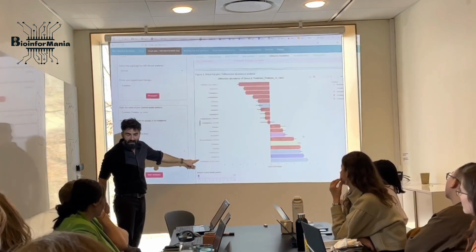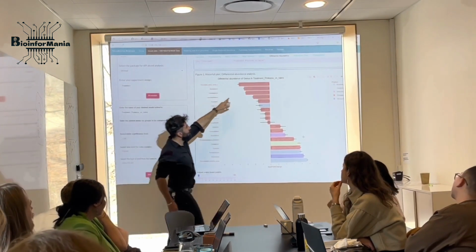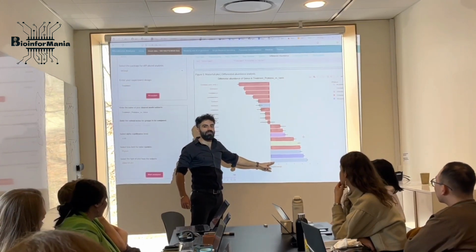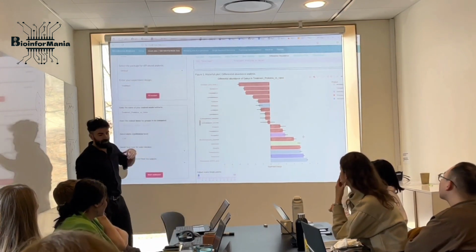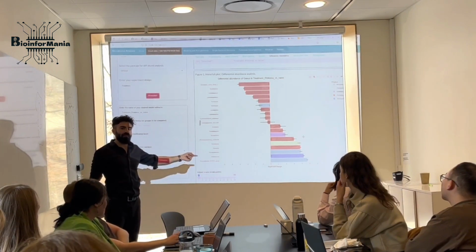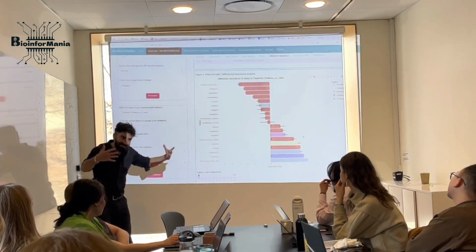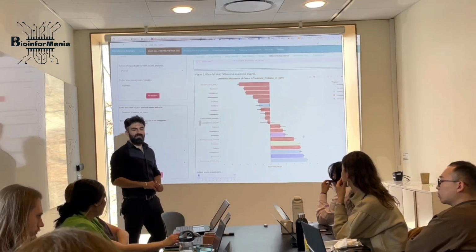And was it this guy? Yes. There we go. And it's protozoa versus naive. Okay? And again, I'm not sure if this is the correct result. Why? Because if you go back to your stacked bar plot, you can see that it's only in week 0 that you have higher protozoa. So week is still confounding. That's why DSIG is not super powerful. We need to go for something that can basically disentangle the effect of unwanted variables.